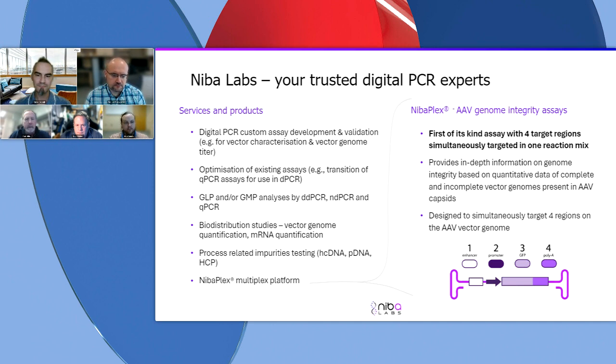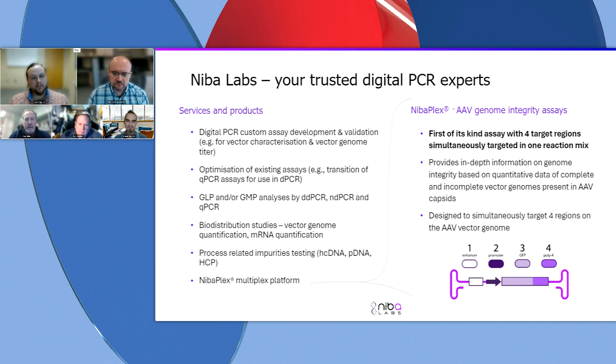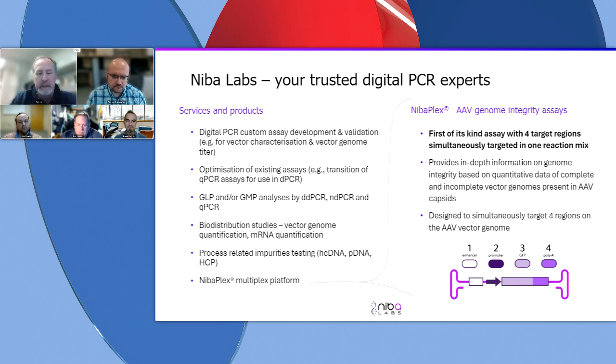Yeah, and I have to agree with pretty much everybody's assessment. We do offer essentially long read sequencing, but as it's pointed out, it is a time-consuming effort. Digital PCR is definitely a very fast way to get to the endpoint of looking at genome integrity, compared to other methods such as agarose gel electrophoresis or, potentially, trying to correlate AUC values or something like that to your efficacy.